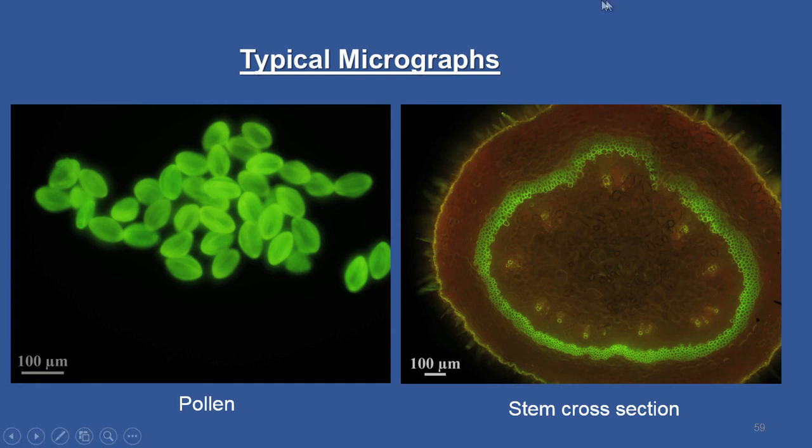And these are typical micrographs obtained through fluorescence microscopy. What I have shown in the earlier classes were taken using a transmission optical microscope, and this is an image of a pollen. Biological people would have done some experiments with this. Pollen is a kind of powder which comes from trees, grass, most of the plants.